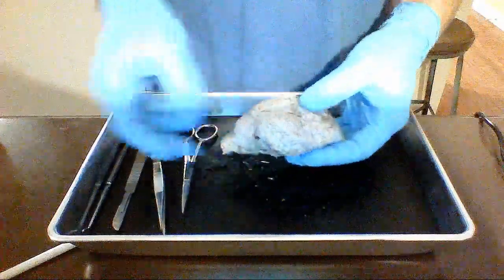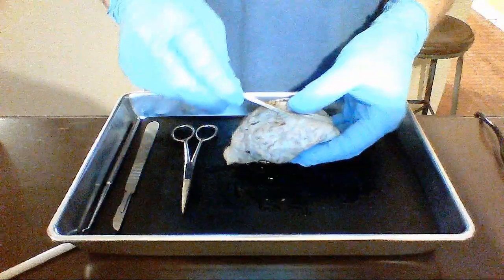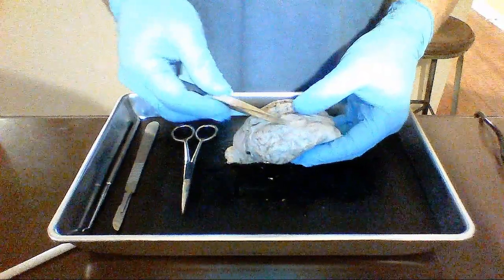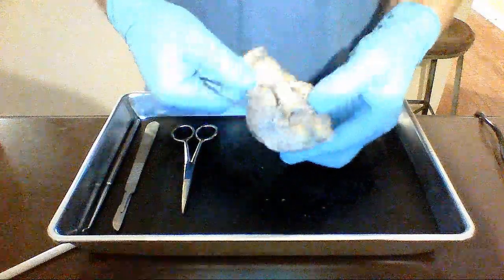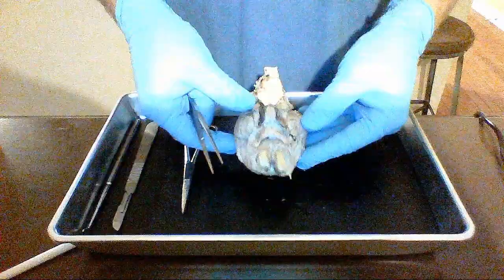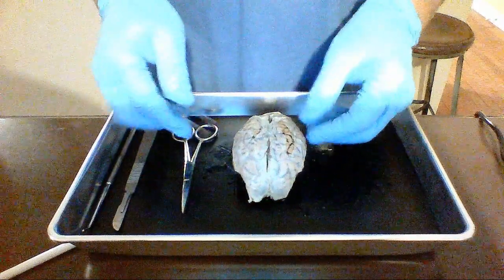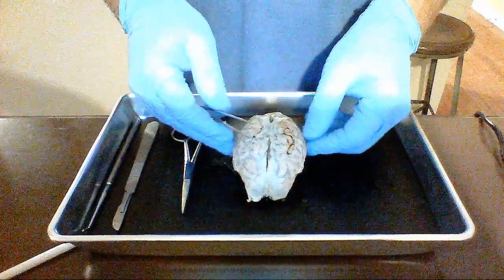Okay, so here we have our sheep brain that we've taken out, and you'll notice there is a covering all around the outside. That is your meninges. The meninges are three layers. They help protect your brain. They have fluid in there called cerebrospinal fluid that helps cushion. And they form the outer portion of your brain.